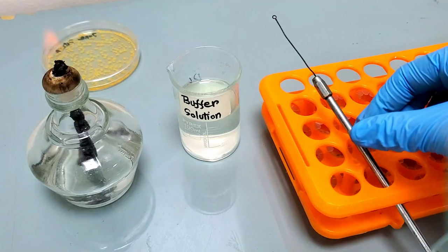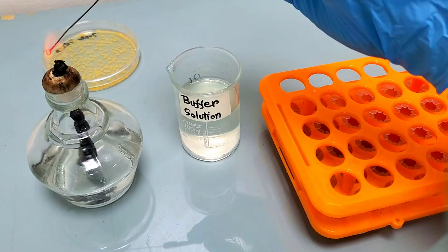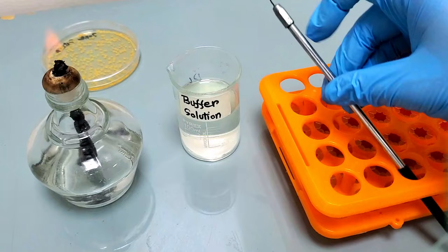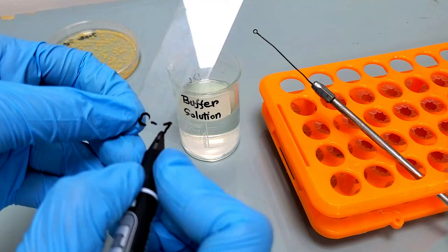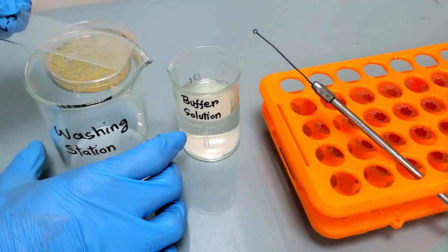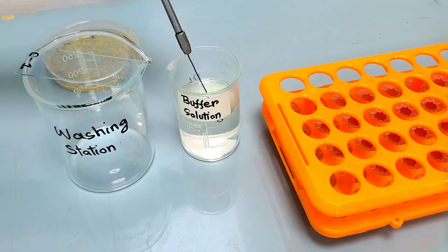Burn the inoculating loop to red hot and cool down for 2 minutes. Label the glass slide with sample number. If you don't have any specific washing station for the Gram staining technique, simply use a beaker for that purpose. Place the glass slide on the washing station. Take a loop full of buffer solution on the middle of the glass slide with the aid of the inoculating loop.